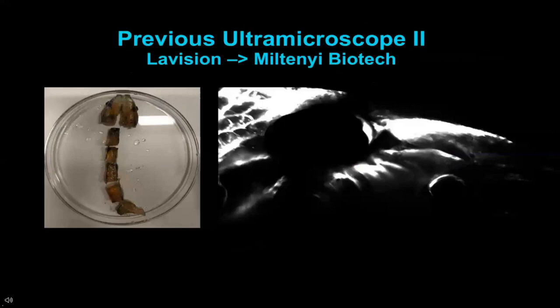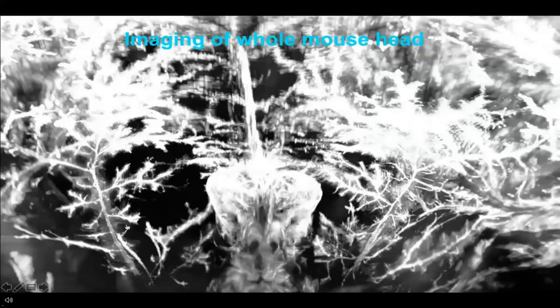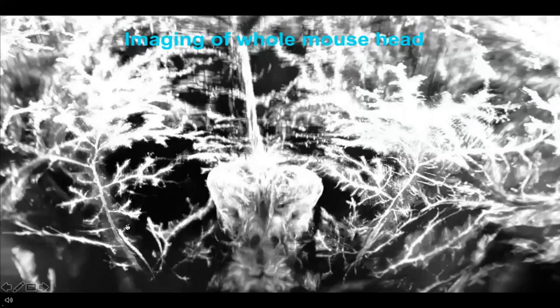The previous Ultramicroscope II we had was from LaVision BioTec, that was later bought by Miltenyi. Here we had to split the mouse head in 2 to fit it in the chamber size. Now with the new microscope, we can image the whole head.